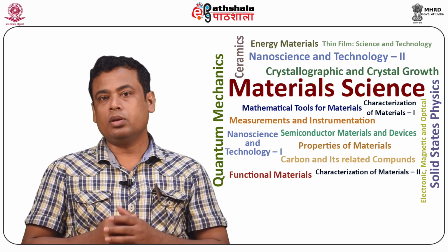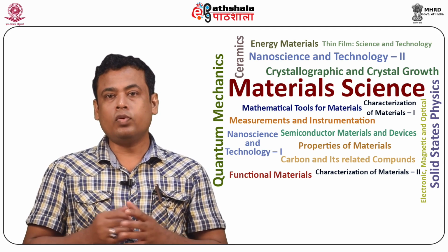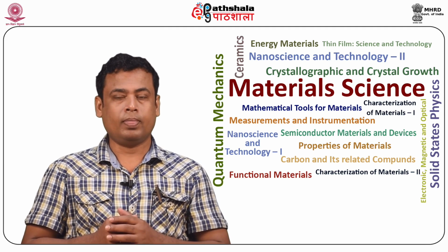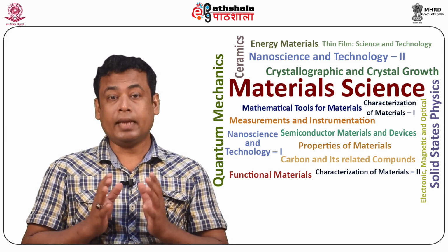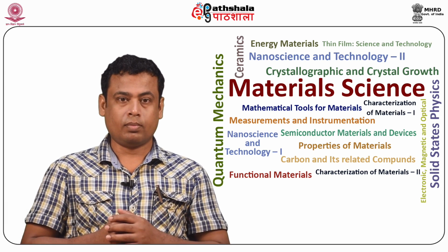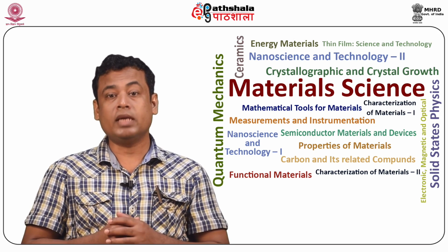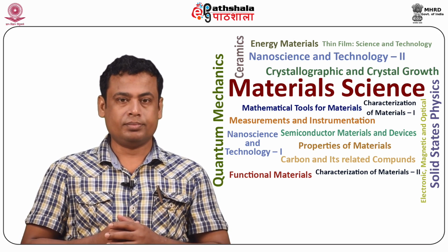This mode operates in the repulsive regime of the van der Waals curve, that is, the force on the tip is repulsive. When the spring constant of the cantilever is lower than the effective spring constant that binds the atoms of the sample together, the cantilever bending occurs. With a constant cantilever deflection using a feedback loop, the force between the probe and the sample is maintained constant and an image of the surface is obtained.